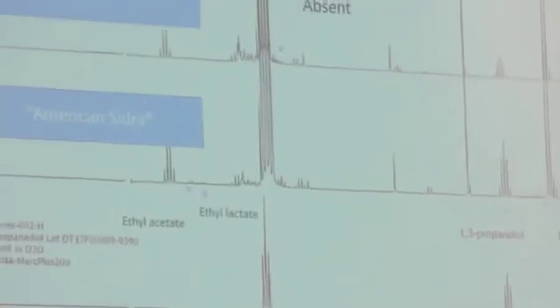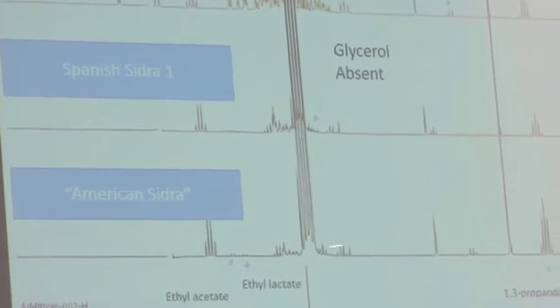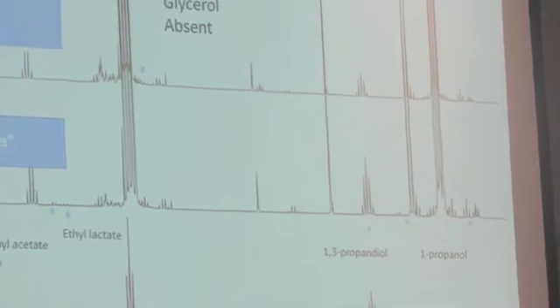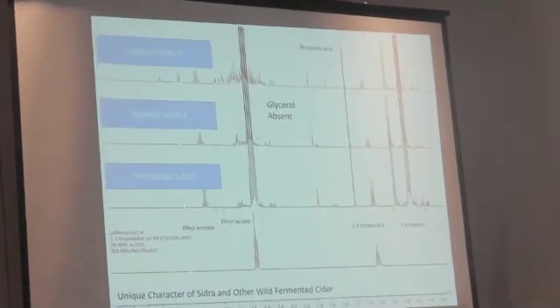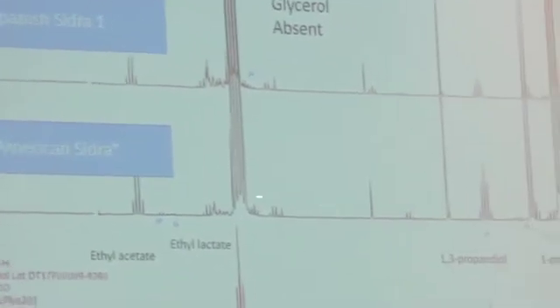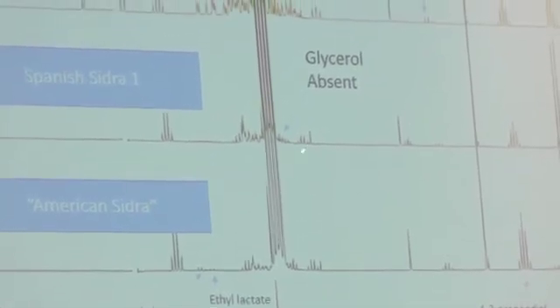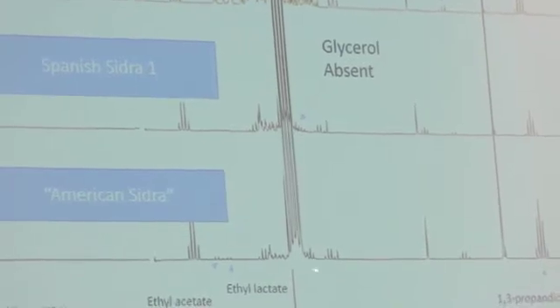So if you look at different Spanish ciders, and then this one was an American cider that was made, they have a ton of stuff that you just don't see in the regular ones over here. At 1.7 there's nothing, right? You go to this guy, and I looked at the Spanish set, and you see this huge peak, and it's big, I mean there's a lot of it there. And then when you look next to the ethanol peak here, those 4 peaks from the glycerol, they're really tiny in this one, you can just about see them. They're not present at all in this one.